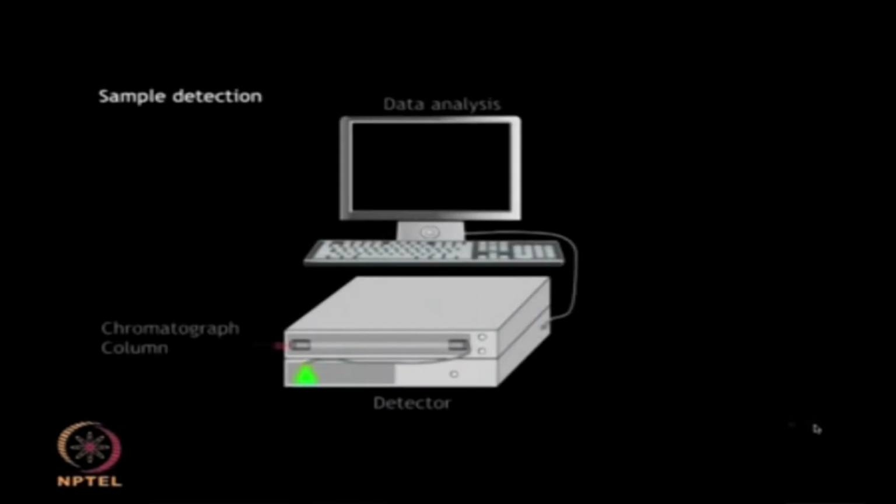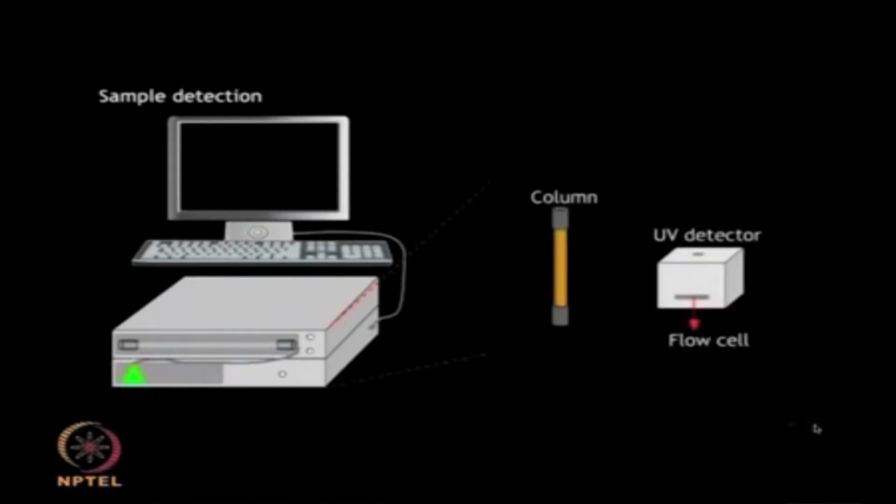Nanoliquid chromatography, which makes use of C18 capillary columns, has gained popularity for proteomic studies due to its ability to achieve fine separations.